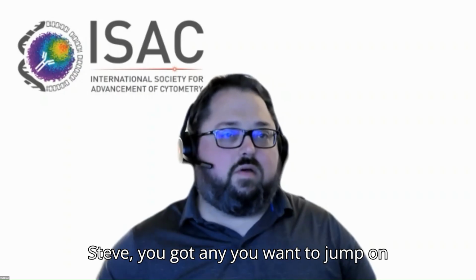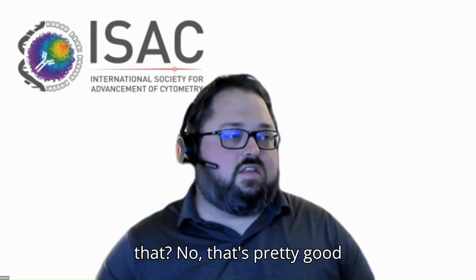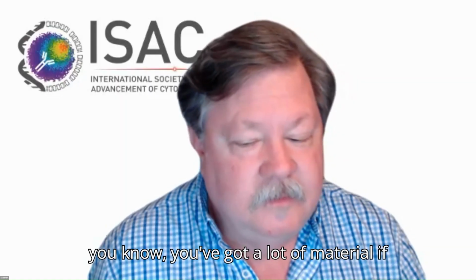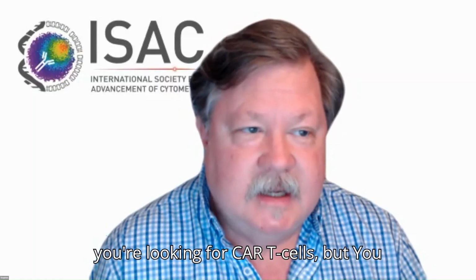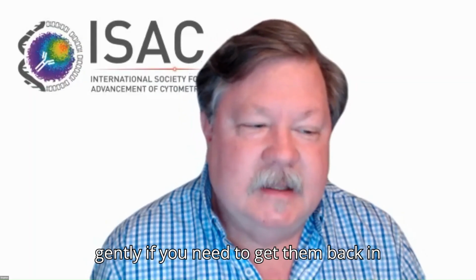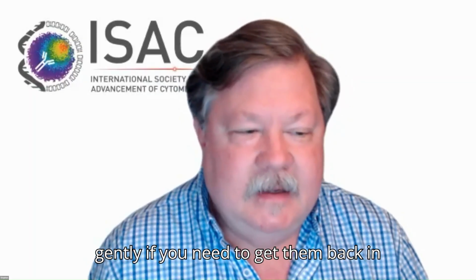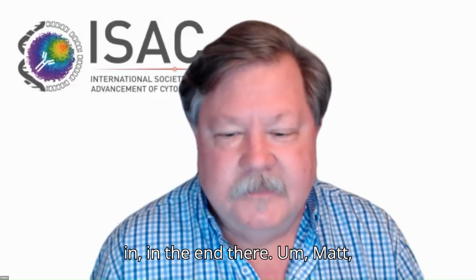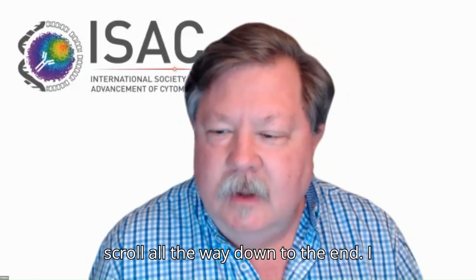Steve, you got any you want to jump on that? No, that's pretty good. Yeah. Sorting is a stressful event, so you really have to keep that in mind. And you've got a lot of material if you're looking for CAR T cells, but you need to go slow and treat them gently if you need to get them back in any viable usage form in the end.